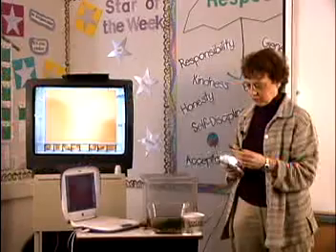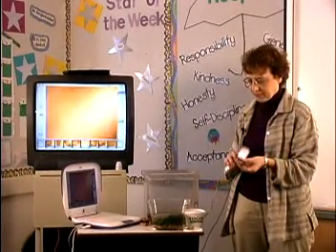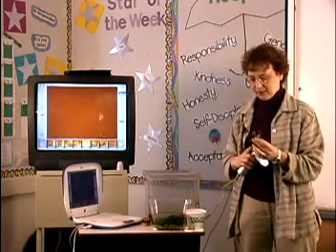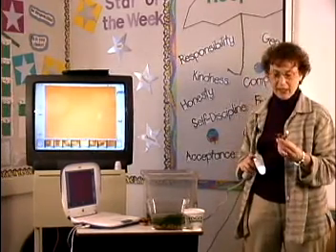Now remember, you're going to be drawing this for me later, so I want you to take some really good observations. That's from the bottom of the tail. From the top of the tail, it looks like this. And later on, you'll have a chance to feel that these little spikes are really very smooth. They're very feathery, like hairs.